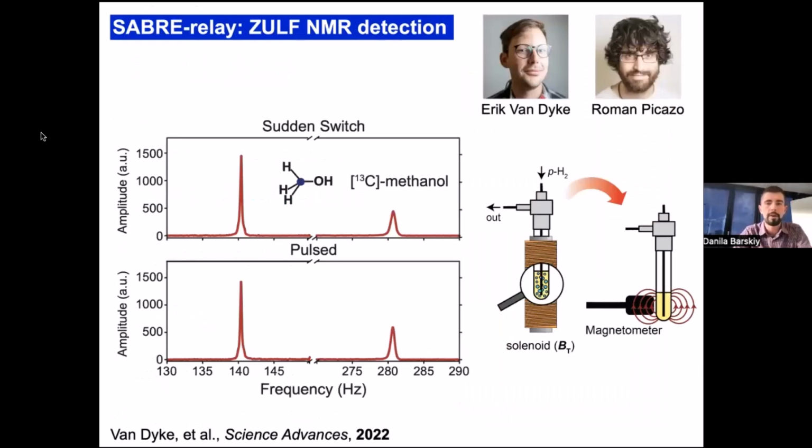So, another direction that we take with this hyperpolarization methodology is using different sensors. Instead of using normal NMR, which is a benchtop NMR spectrometer or a high field NMR spectrometer, we can use optical magnetometers. These are devices which measure the field directly, and you can use atomic magnetometers. There's also published work on using NV centers in diamonds, and there is also a magnetoresistive sensor. So there are actually many different types of devices which can measure magnetic field, and you can start using them.